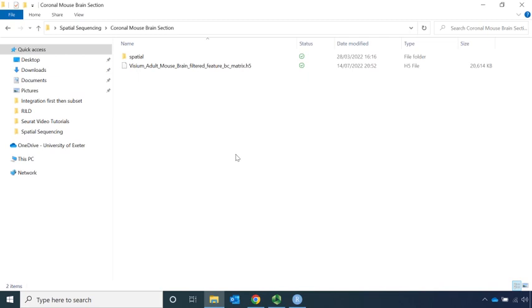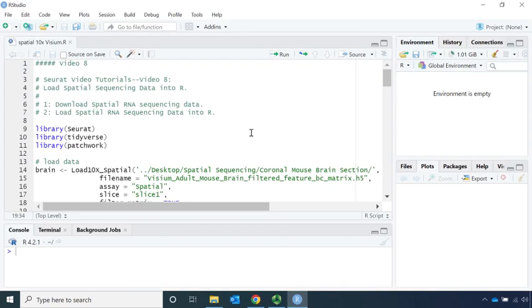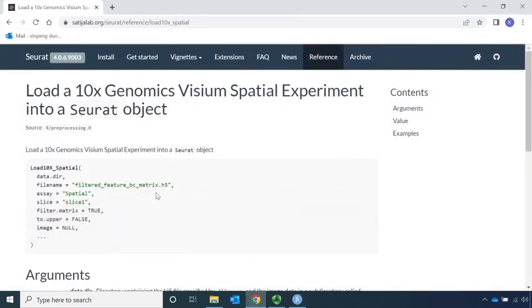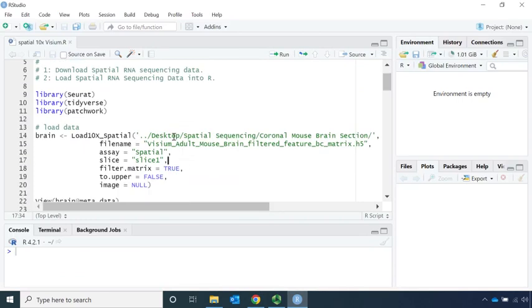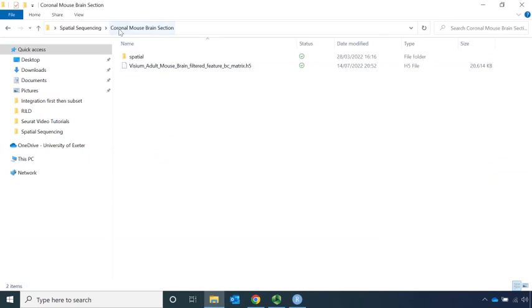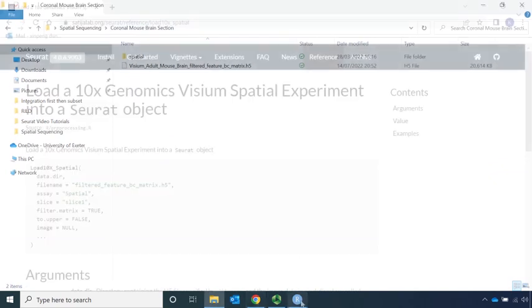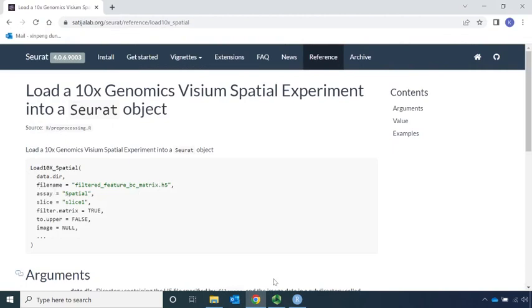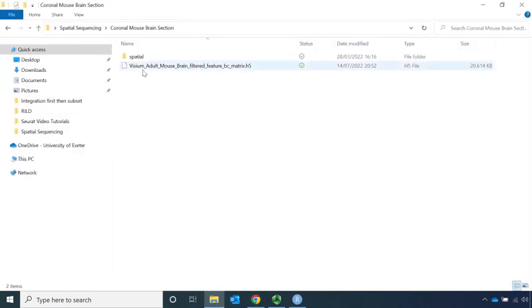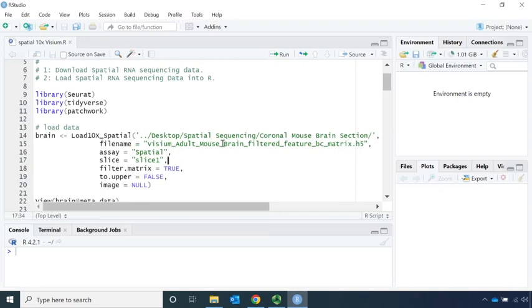Now we have the files ready to read them into RStudio. To read the spatial sequencing data into R, we need to use the function Load10X_Spatial. Let's have a look at this function on the Seurat web page. For this function, first we need the files directory. In our code, we saved the data in the folder called 'Coronal Mouse Brain Section'. Next is the file name for the HDF5 file — here is the full name for the HDF5 file, and we use that full name in the code.